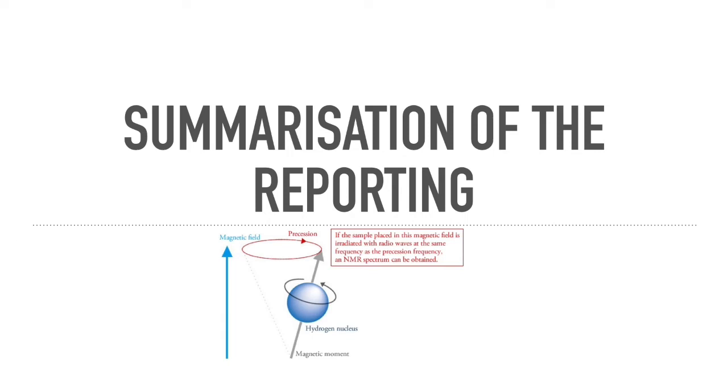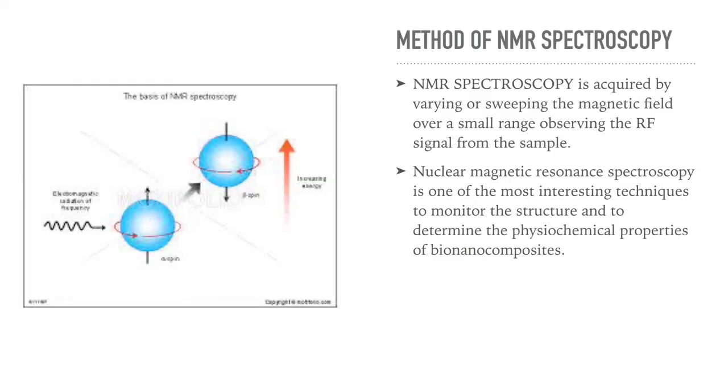From this, we learned that there are different types of spectroscopy, which was explained by Pratik: continuous wave, pulsed, or Fourier transform NMR. And as explained by Bhavani, there are different applications of NMR spectroscopy, which are in the structure of organic molecules, proteins, amino acids, carotenoids, organic acids, etc. Biofluids, perfused organs, and biomolecules such as nucleic acids, DNA, RNA, etc. It is also used to study high pressure, diffusion, and is also used in food sciences.